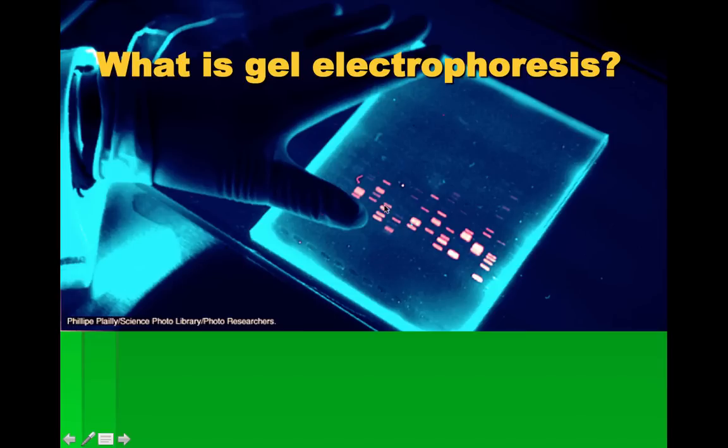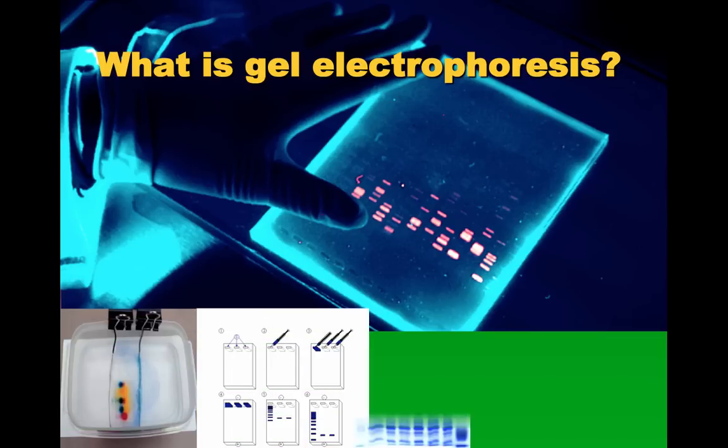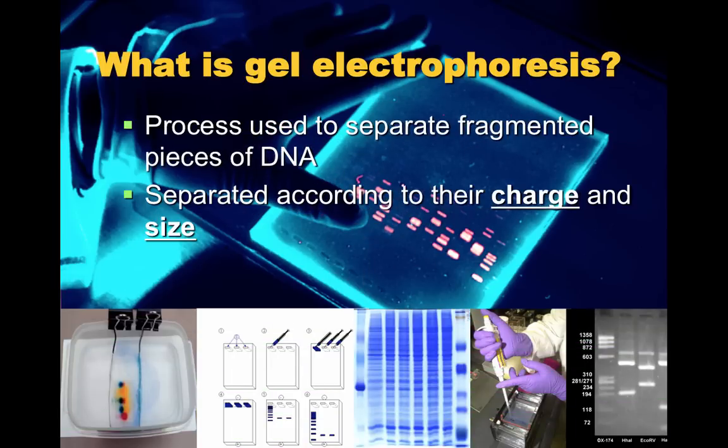And what we're looking at here are bands of DNA, and we have to look at this in more detail to understand, because each one of these lines is not one chunk of DNA. Each one of these lines is a pile of a bunch of strands of DNA that are all the same lengths. So there will be various activities you might try out in class that could help you visualize what's going on here to do this entire process. But what it does is it separates DNA.